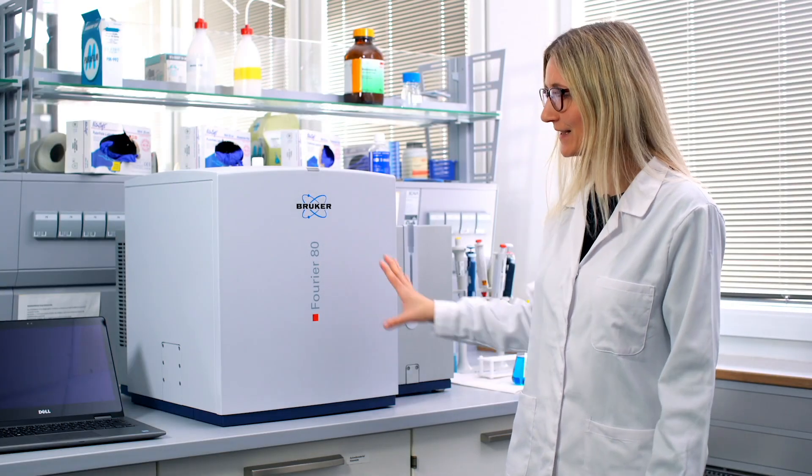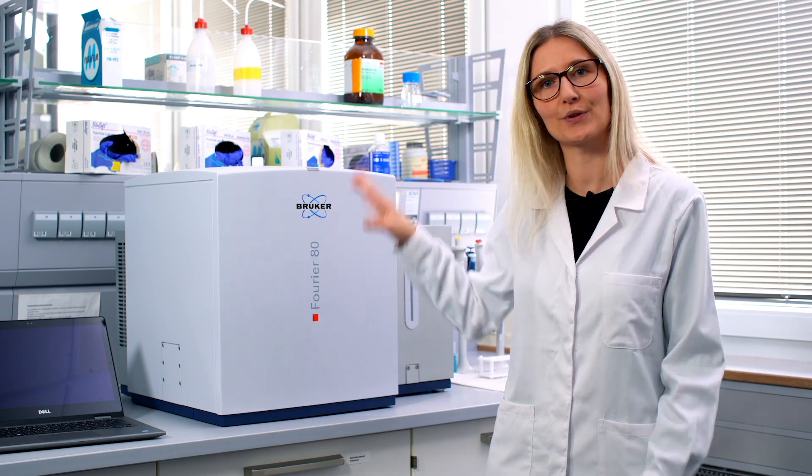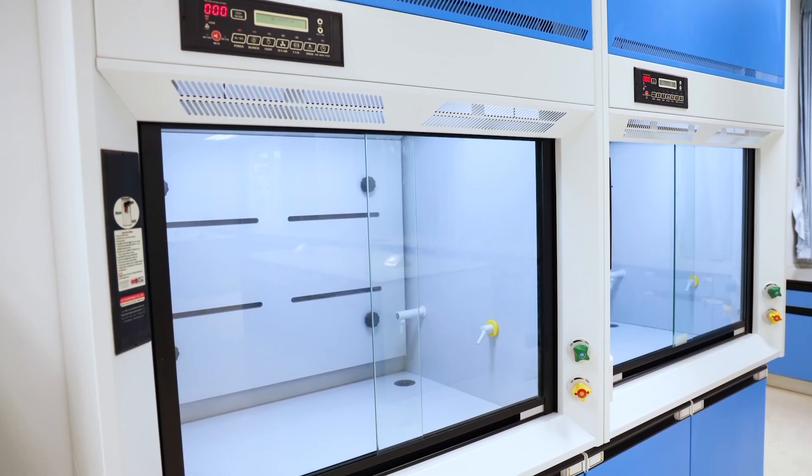As you can see, the Fourier 80 fits nicely on a standard lab bench. Of course, you can also put it in a fume hood if you like or on the table.